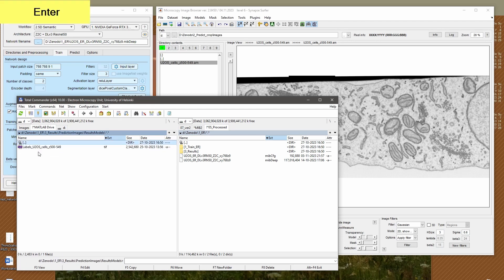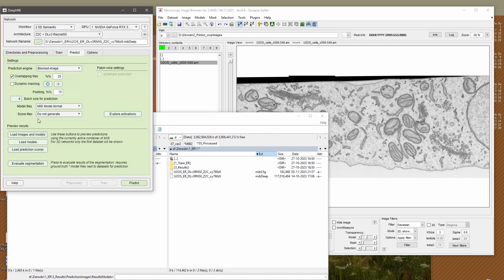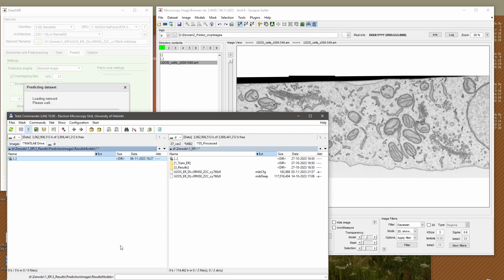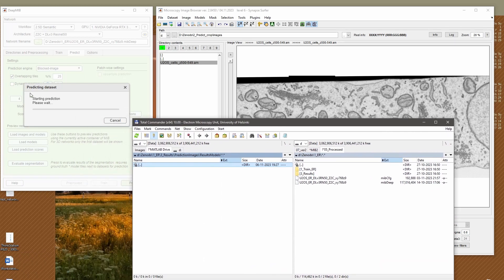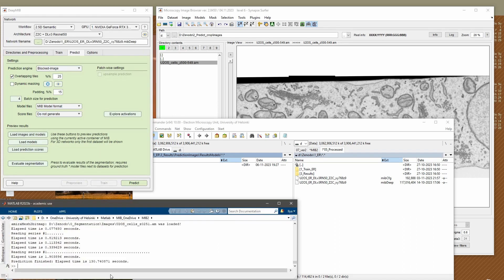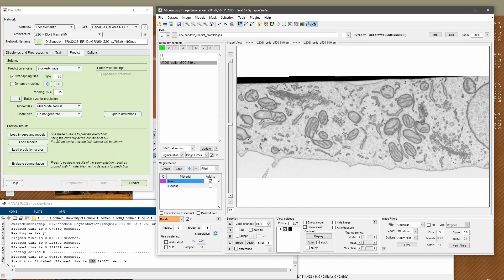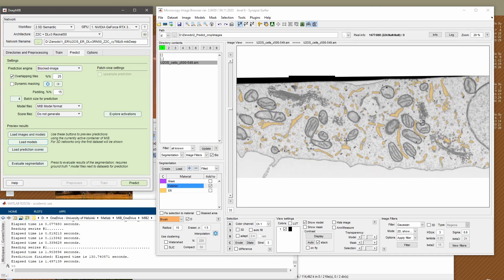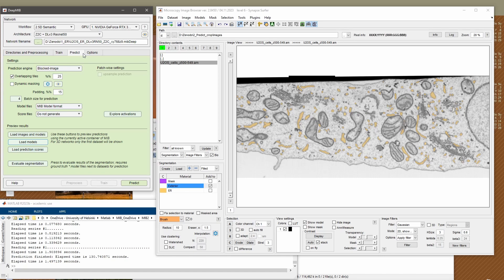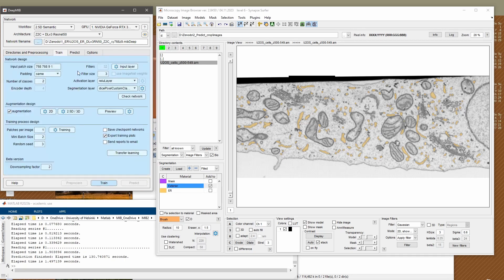I already have the dataset predicted, so I can load existing results, but I can also do the prediction myself. Going to the Predict tab and using these parameters, I press the Predict button. The prediction started and after about 130 seconds it's complete. I can then click 'Load images and models' to view the segmentation of the endoplasmic reticulum. If you want to apply this to any other dataset, you just select the directory with images, select the proper file extension, and hit the Predict button.